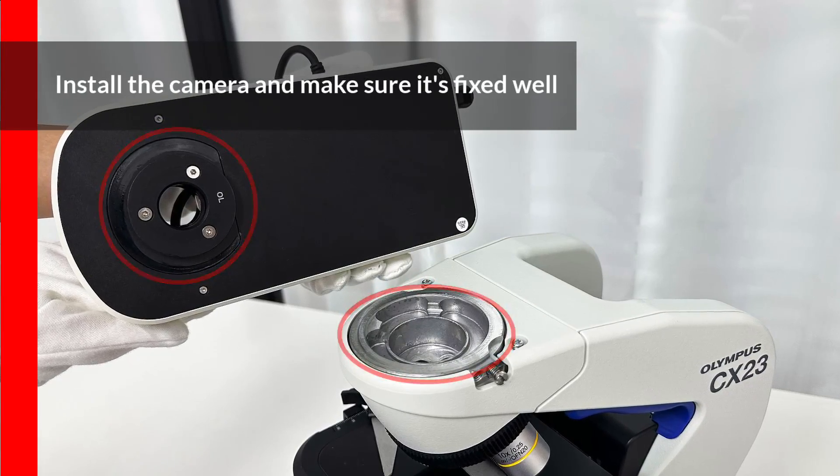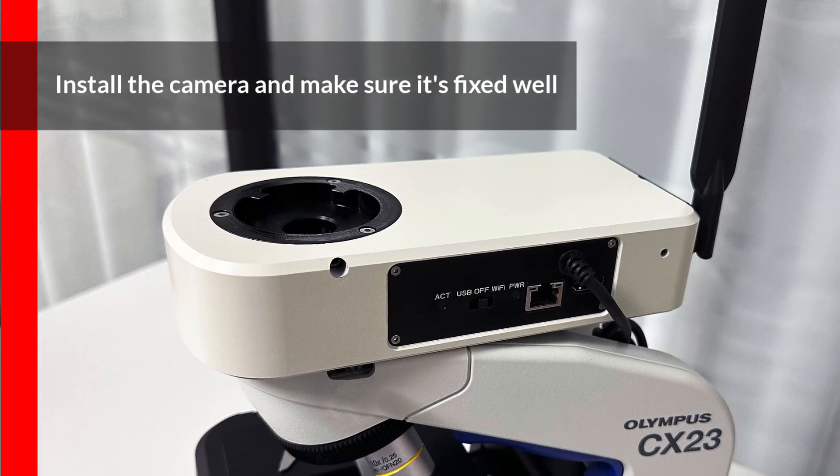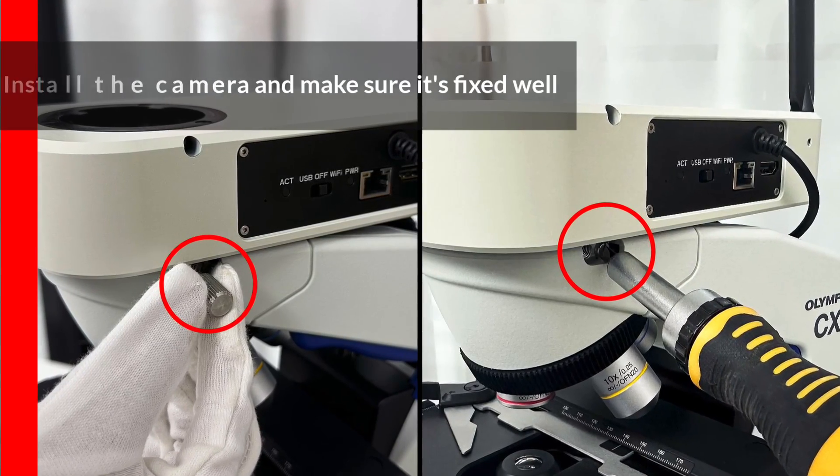The Lanoptic multi-output embedded camera is a perfect fit for the dovetail mount of the Olympus CX23 and can be directly attached to the body. Ensure that the camera is facing forward and securely fixed.